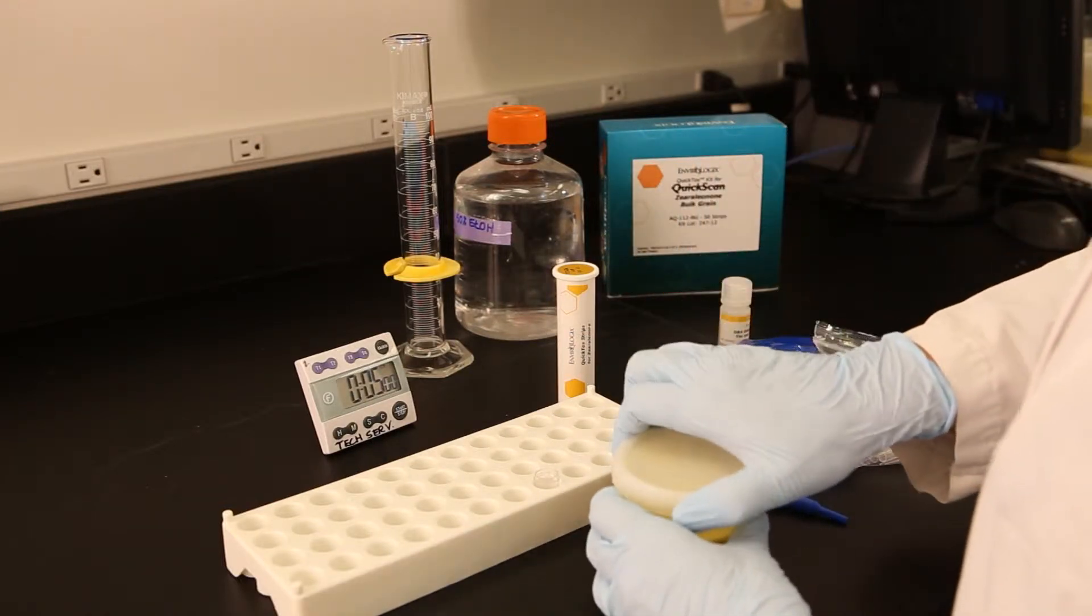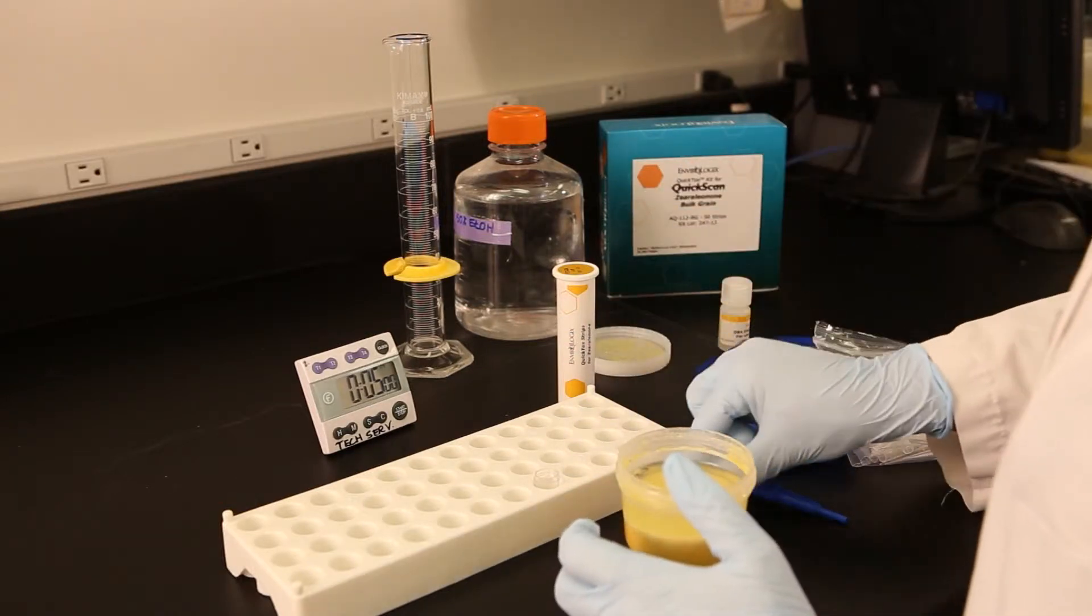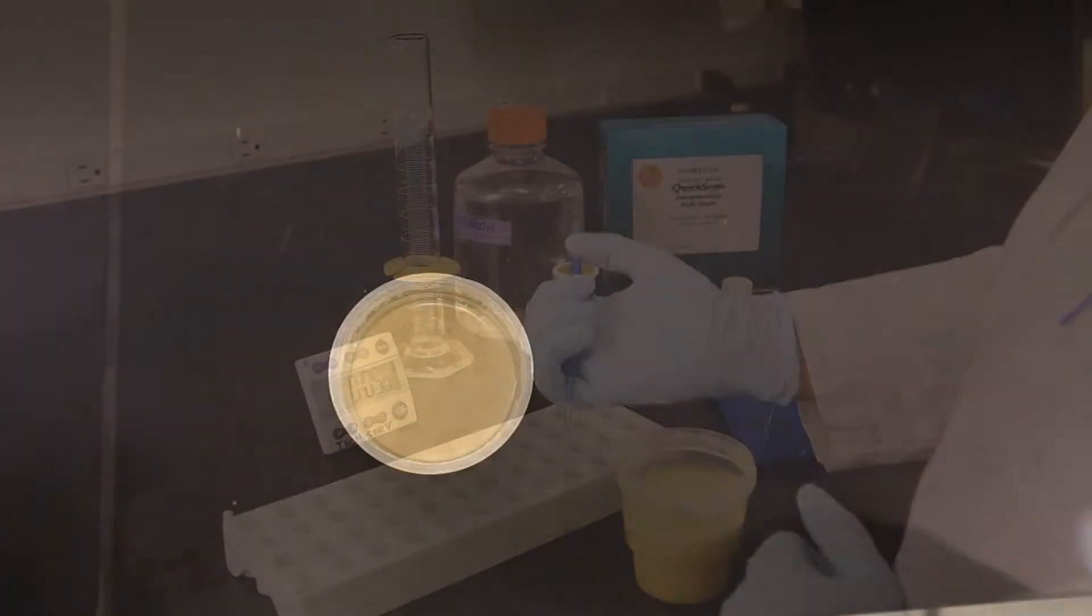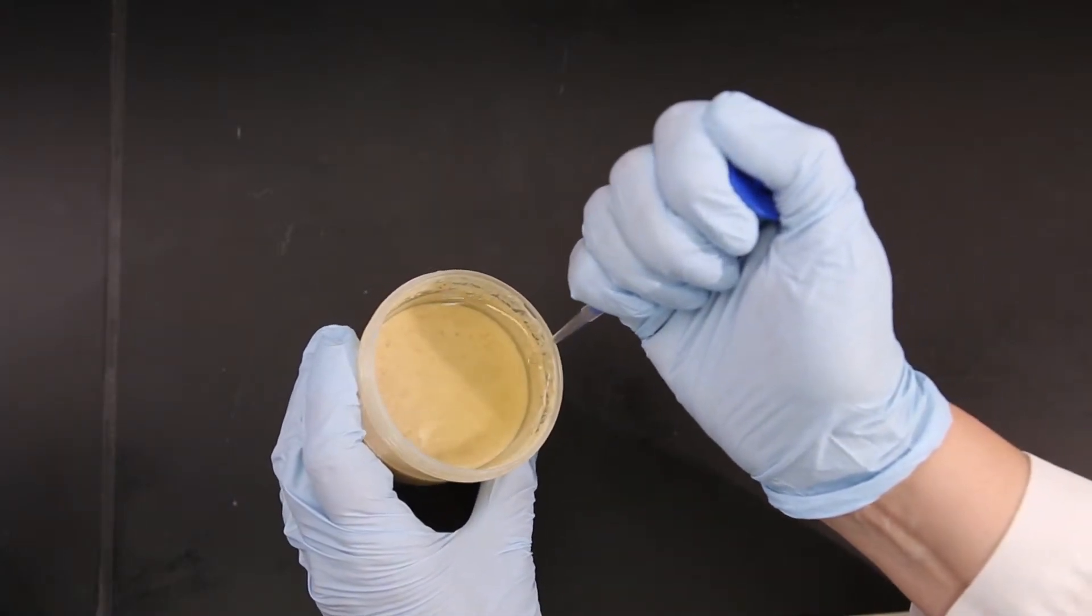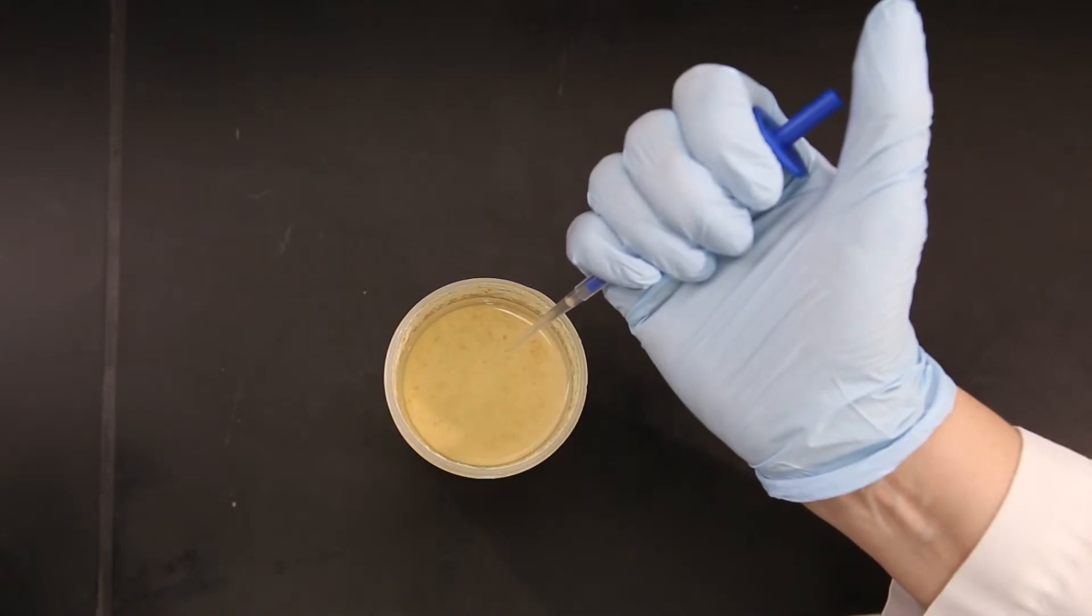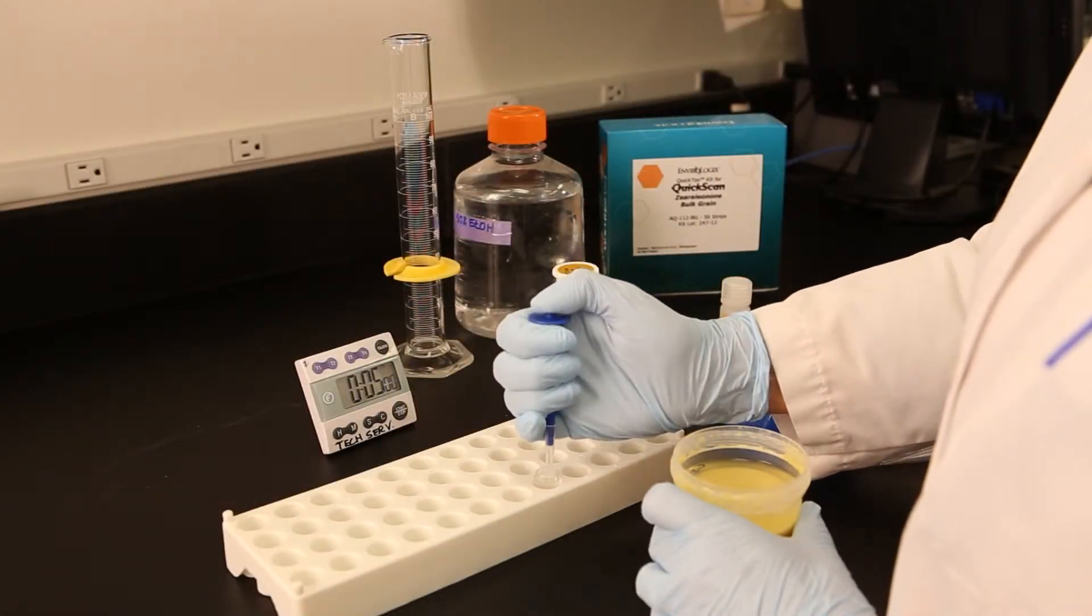With a fresh pipette tip, pipette 100 microliters of sample from the top layer of the settled extract into the reaction vial. Pipette settled extract at a 45 degree angle to avoid foam and particulates. Mix well with pipette by drawing liquids up and down in the pipette tip.